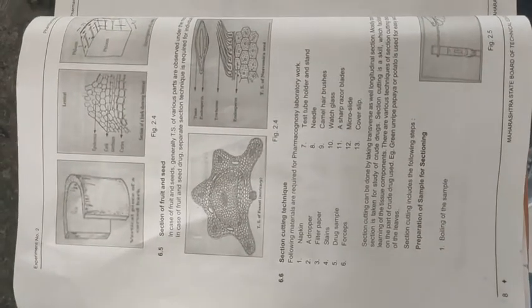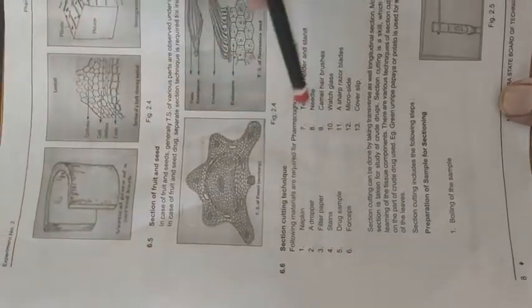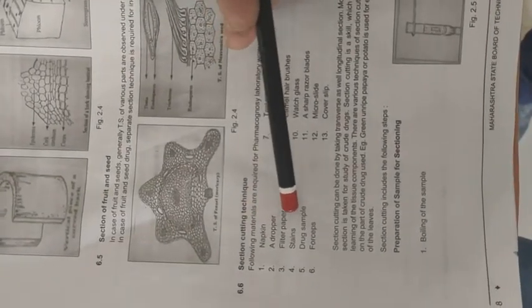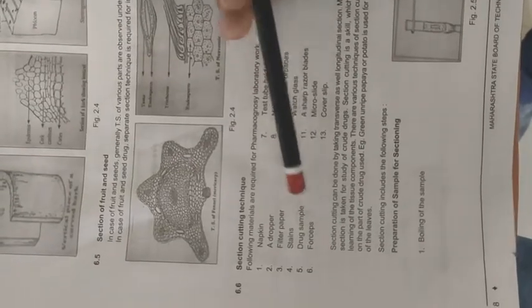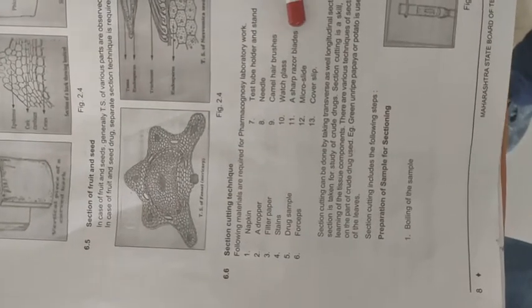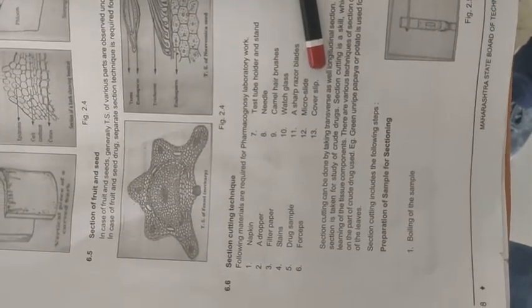Mostly we use the transverse section. There are two types of section cutting, that is TS and longitudinal section cutting techniques. These are the main important things. Materials required for section cutting are napkin, dropper, filter paper, stain, drug sample, forceps, test tube holder and stand, needle, camel hair brush, watch glass, sharp razor blade, micro slide and cover slip. Again, you can observe that these are the requirements for section cutting.